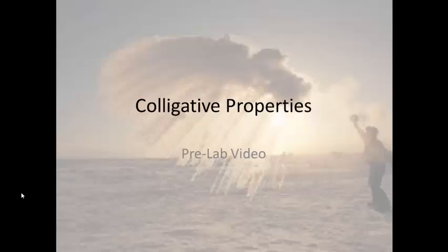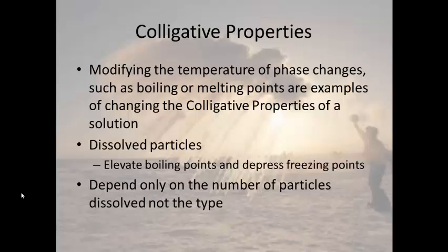This is your pre-lab video for the Colligative Properties lab. Colligative properties are those properties of solvents that can change when solute is dissolved in them. And the modification of temperatures of phase changes like freezing point, melting point, and boiling point are examples of a changing colligative property of a solution.